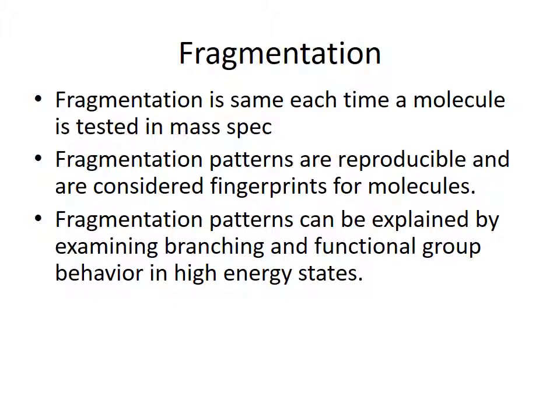So when, let's say, you go to the hospital and it appears that you've overdosed on a drug, they might take your blood and extract it and inject it in a GC mass spec and tell the computer to look for various drugs to see if they can detect those in there. This is what they do when they do drug detection for jobs, is they actually look for small quantities of drugs that you might have been taking. So that fragmentation pattern is a fingerprint, and the computer can match those up.